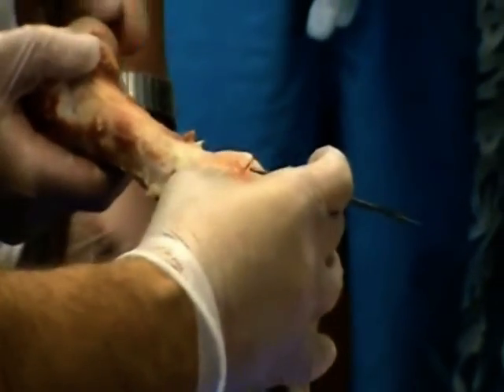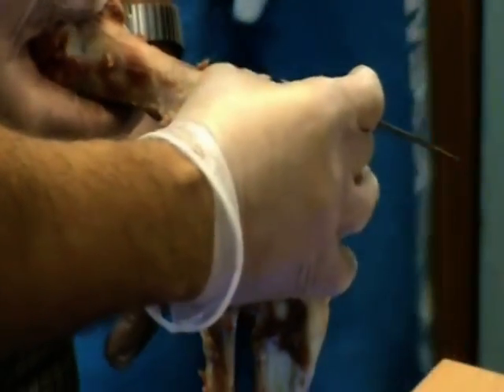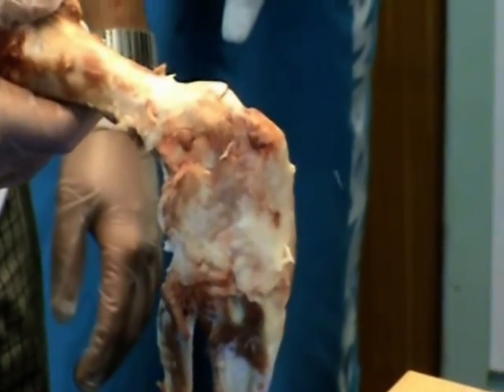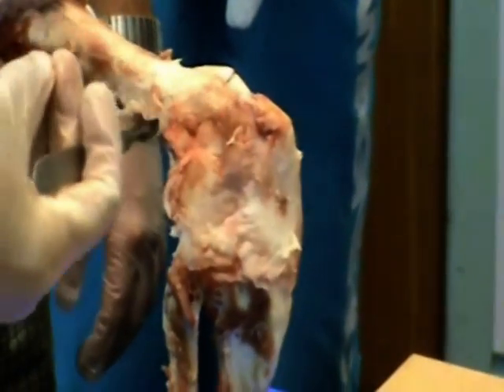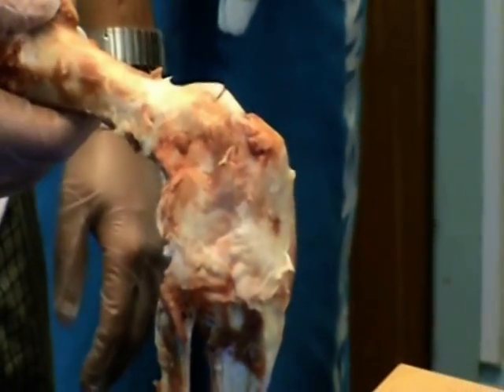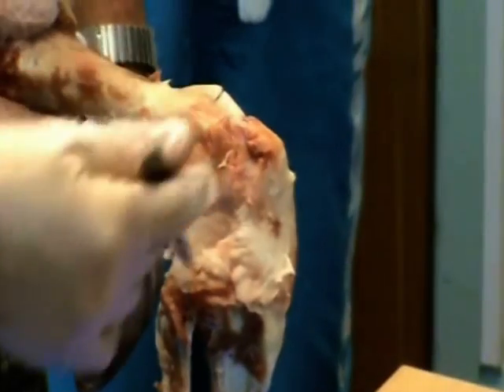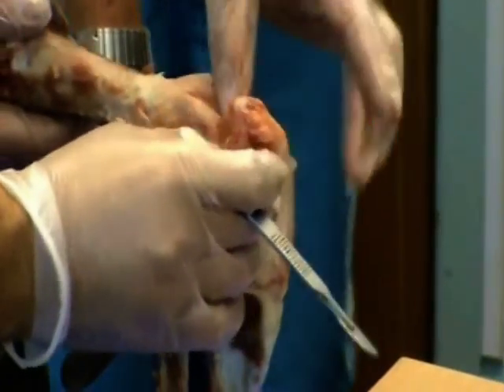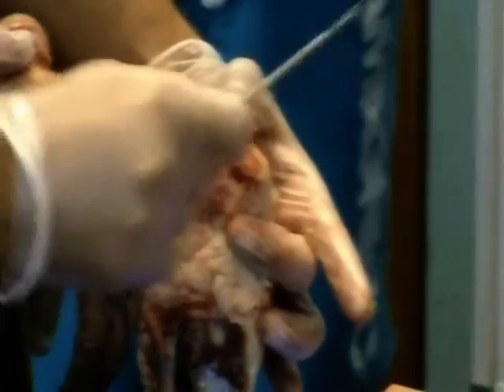Just hold that there. By the way, guys, if you touch this and you're wearing gloves, make sure when you take the gloves off, you don't touch the outside of the glove with your hands. Also, don't lick your fingers, scratch your head, or push someone with the gloves on. Okay. No licking, no biting, no flicking. No crutch.